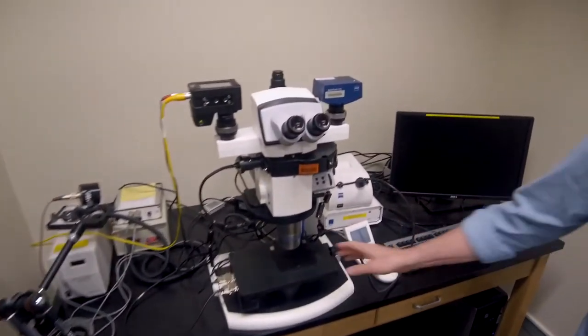One of the reasons that I do electron microscopy and light microscopy and all the different things that we do that produces images is it's very direct.